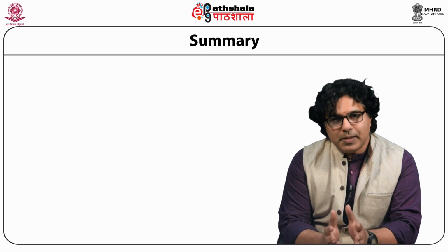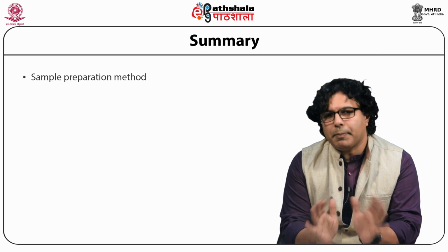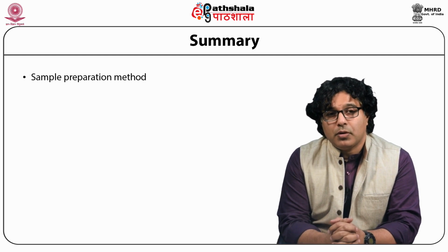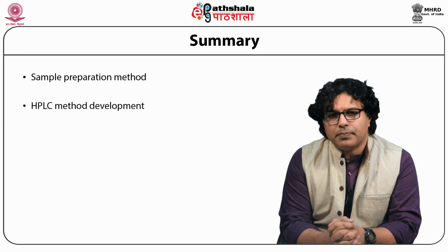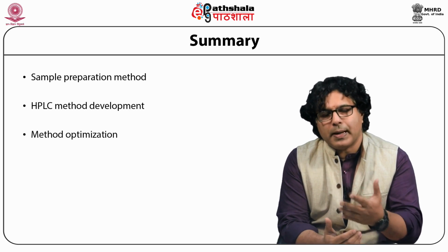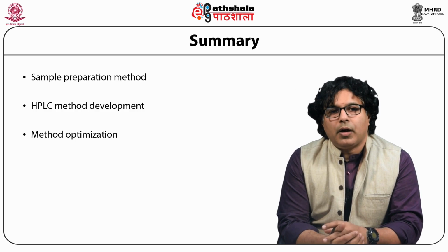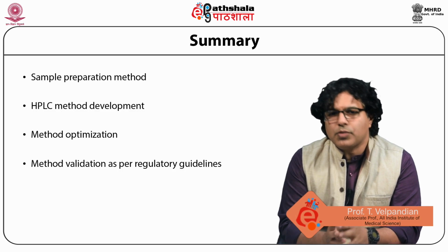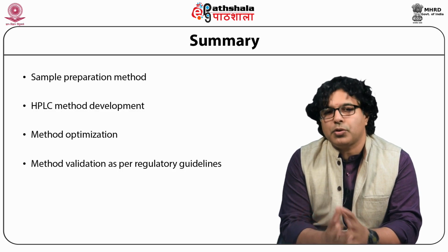So students, let me summarize what we have learned from today's module. I have explained sample preparation methods, how to find a suitable method for developing your own HPLC method, and how to develop an HPLC method for a particular analyte. If you develop a method, we saw how to optimize it, and after optimization, meaning peak optimization, we saw method validation as per regulatory guidelines. Together, this will help you in successfully developing a method and validating it to suit your application.